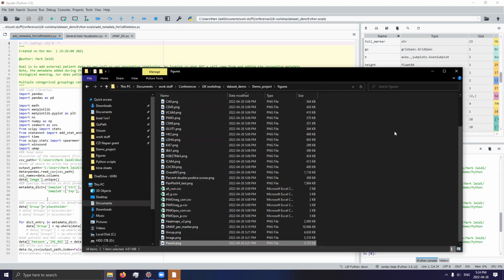And so a lot of the considerations in terms of how the data was being partitioned, grouped, how double positive scores, single positive scores are being calculated, all of this was essentially done with that in mind, that we're trying to identify genes that are upregulated or downregulated under hypoxia.